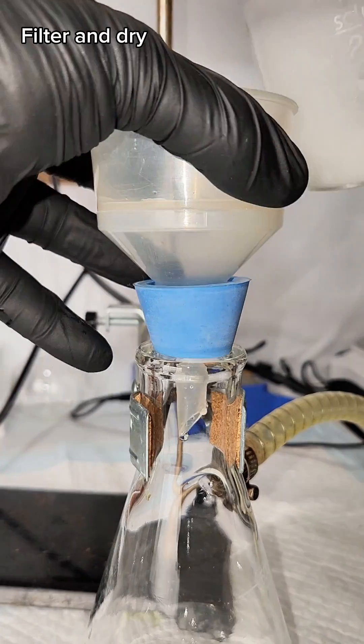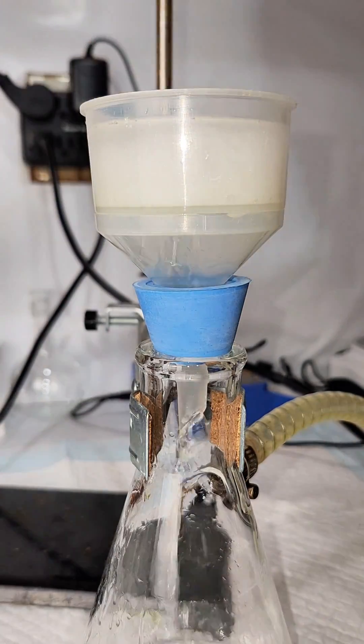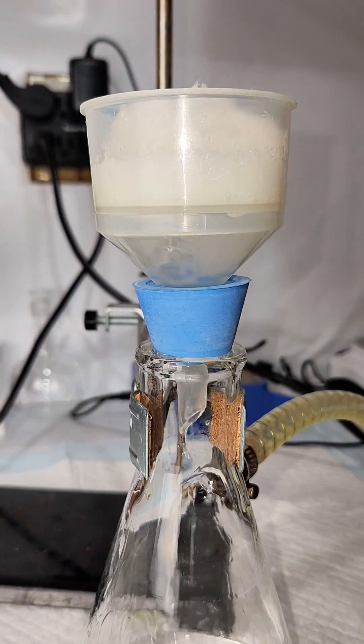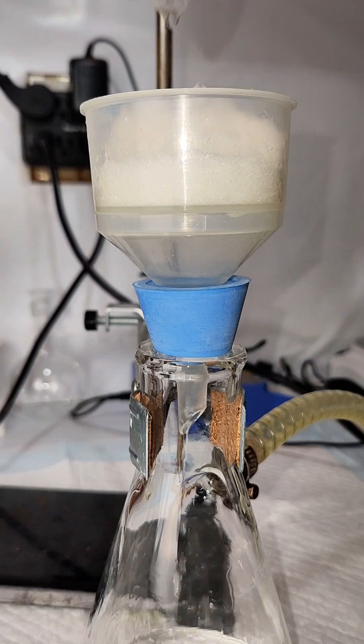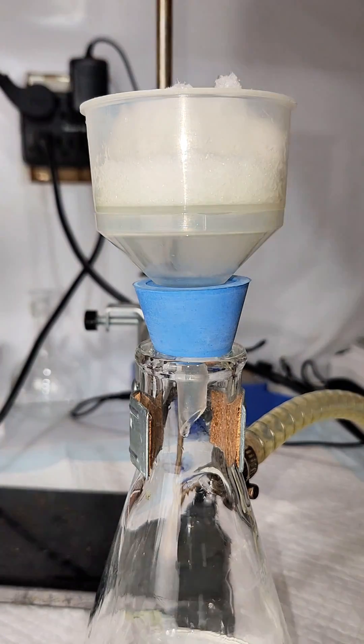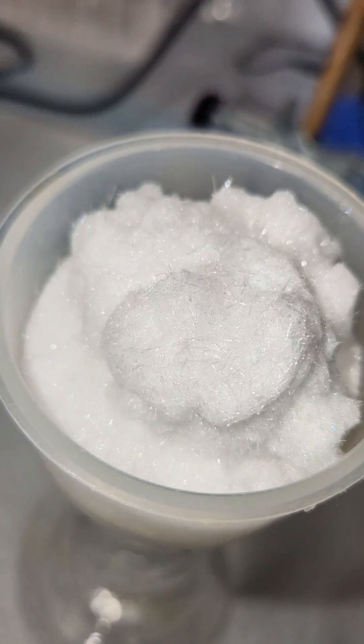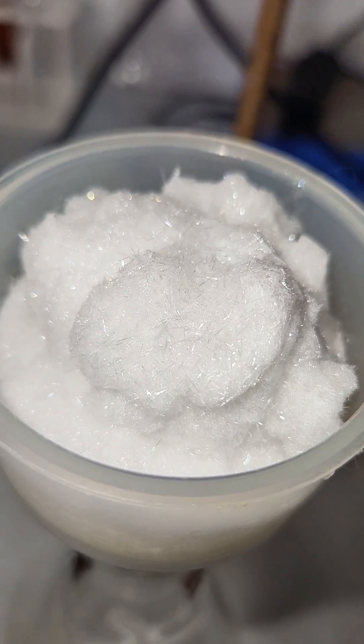Once my recrystallization is complete, I pass my product through vacuum filtration and then dry it overnight under vacuum desiccation. The final result was exactly 8 grams of these very nice looking phthalamide crystals, which represents an 81% yield.